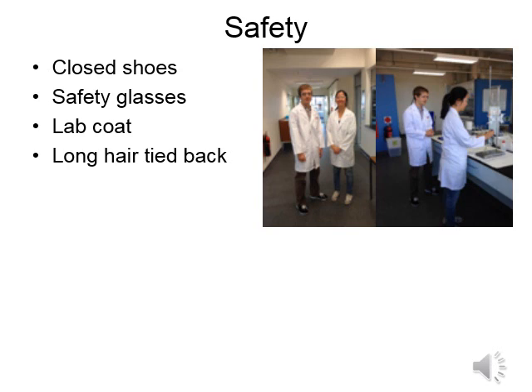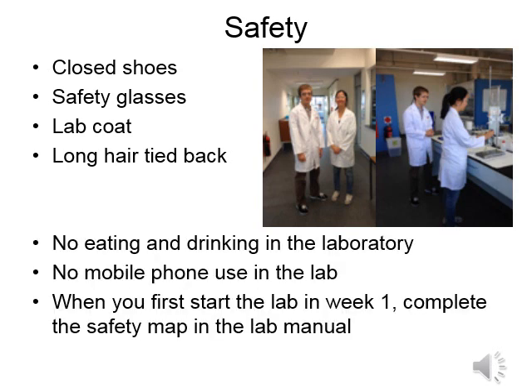As usual, there should be no eating or drinking in the laboratory, and you are not permitted to use your mobile phones while you're in the lab. If you absolutely must take a call, please step outside. The only exception to this rule is that you may use your camera to photograph some results for your report, such as your TLC plates. However, you will need to put your phone in a zip bag in order to avoid chemical contamination.